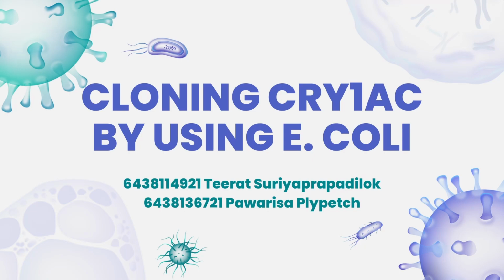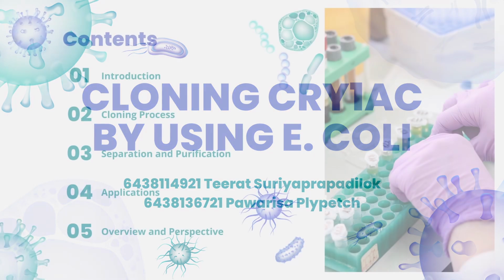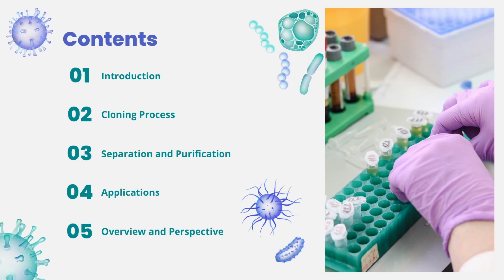Cloning Cry1Ac by using E. coli. The contents we will talk about today will start off with an introduction along with the cloning process, followed by the separation and purification process, then the applications, and ending with the overview and perspective.